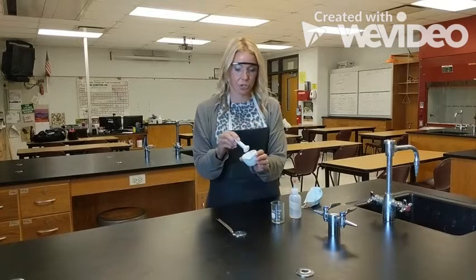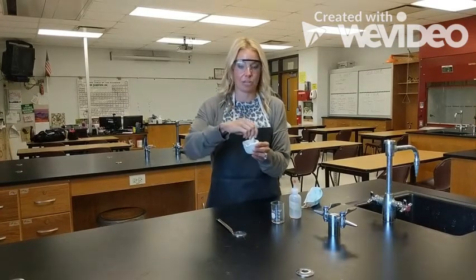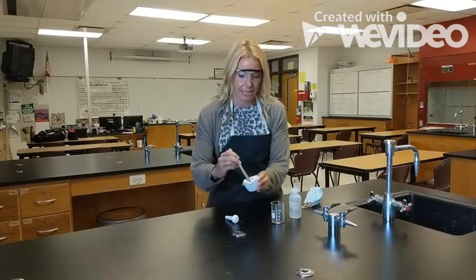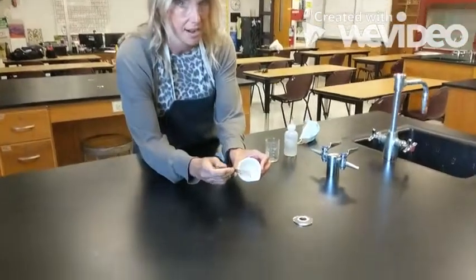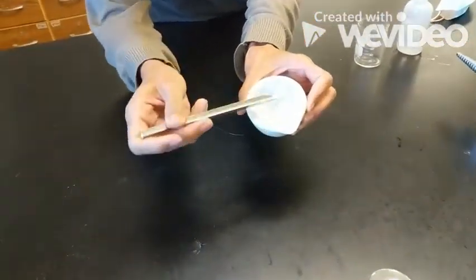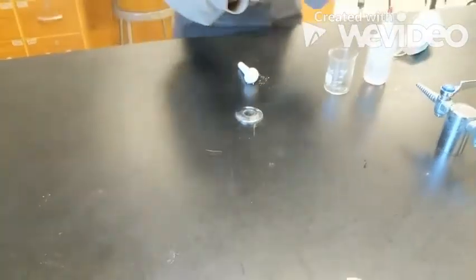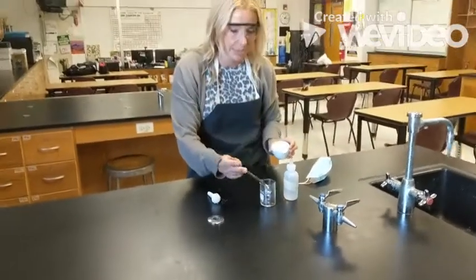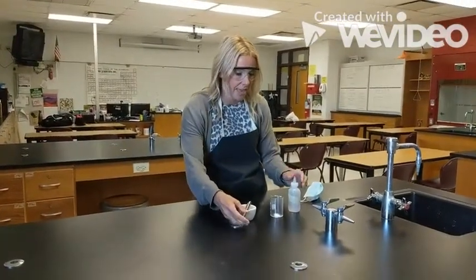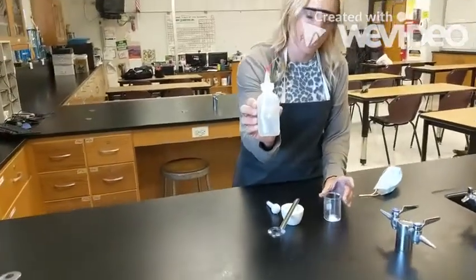So in Station 2 we took some chalk and we put it in a mortar and pestle and we ground it up. And then we're going to take our spatula, and you can notice what our substance looks like beforehand. Make sure you're making your observations in your data table. And I'm going to take 1 scoop of our substance and put it into our small beaker. And then I'm going to take our vinegar, and you can notice what that looks like beforehand.